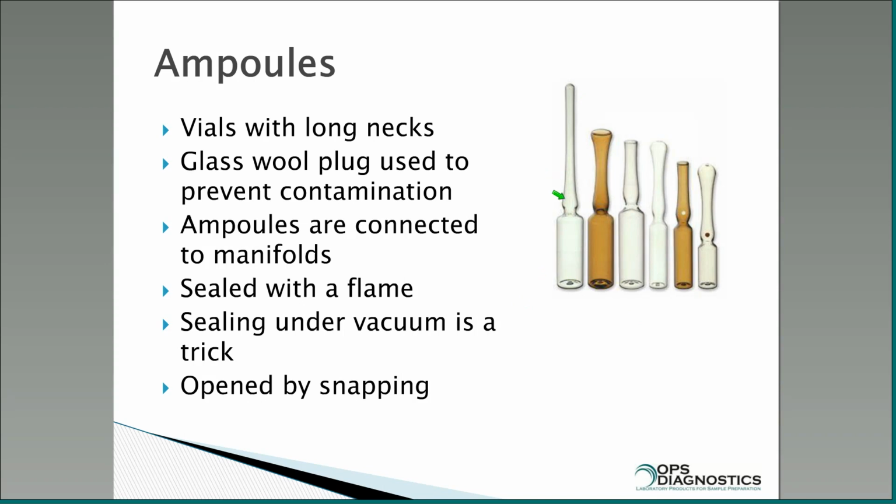One of the things you have to worry about with these, if you've ever worked with ampoules, is that when you load these up, you're going to need a long neck Pasteur pipette. If you have a culture and you want to pipette it into the bottom, a micropipette won't work because you'll end up getting all your liquid on the neck, and that just makes for a messy situation.